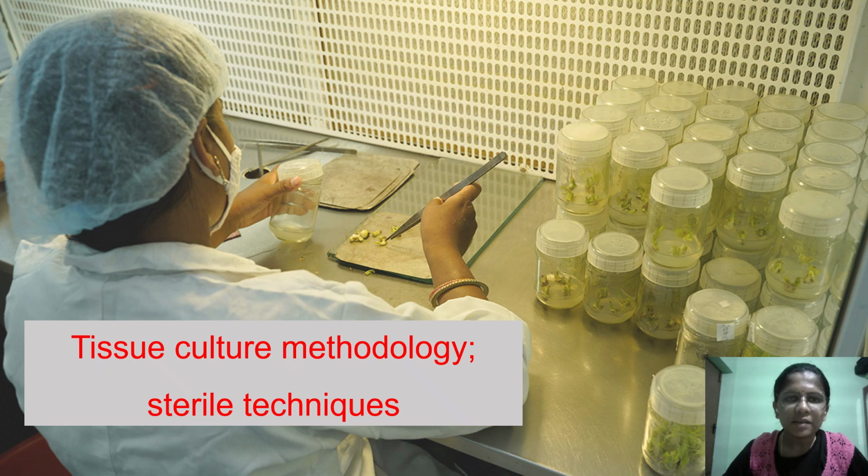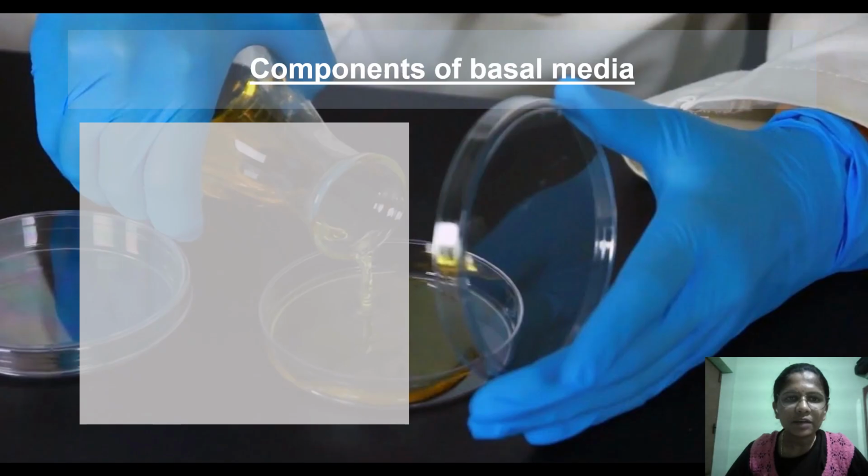And now we will see what the possible ways of contamination are, and where we have to actually concentrate on avoiding the contamination and other things in order to achieve success in tissue culture. We'll see one by one.